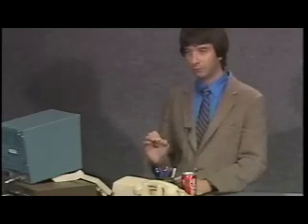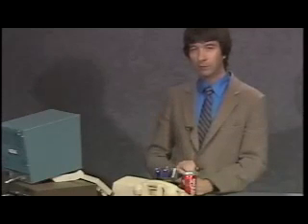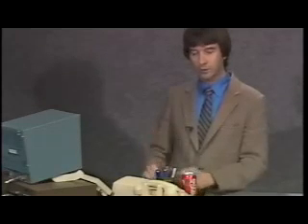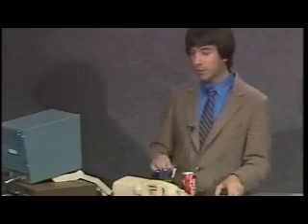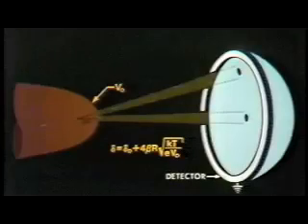Now remember, helium has the highest ionization potential of all the gases. The electric field required to ionize helium is of the order of 4.5 volts per angstrom, 450 million volts per centimeter. All right? That's the field strength at which we'll see the first images. But we see some other things as well, which are kind of curious. Can I have that first tape, please?